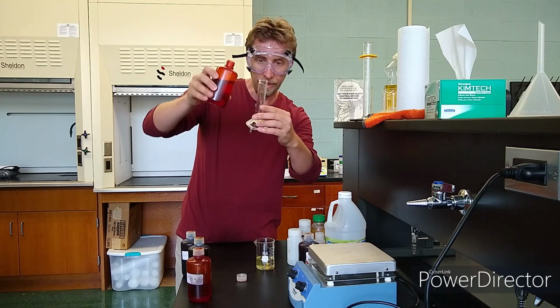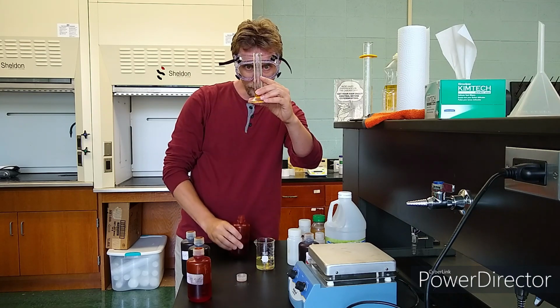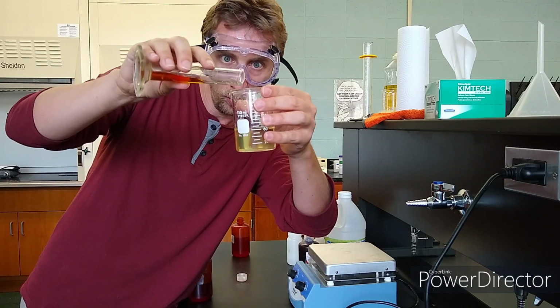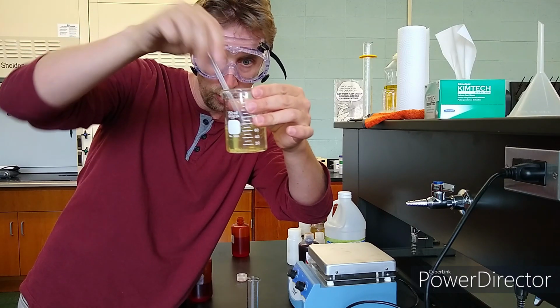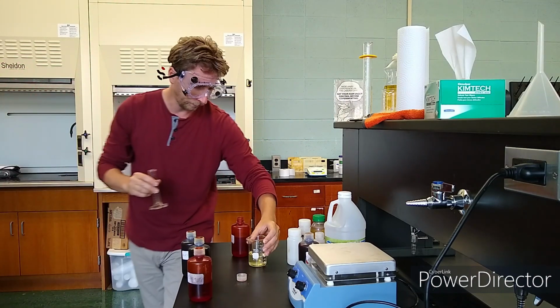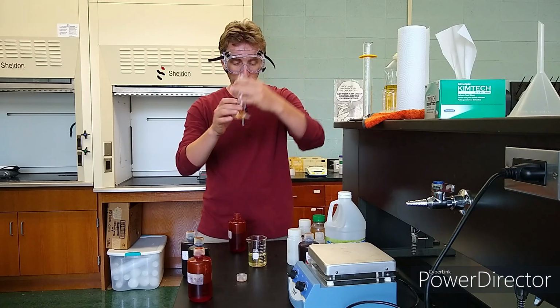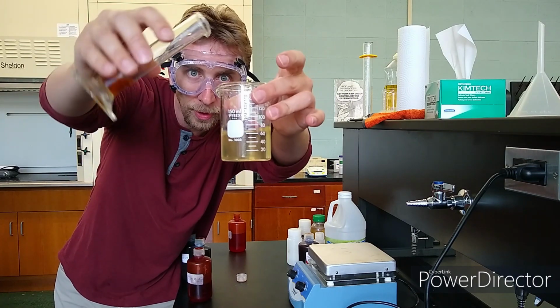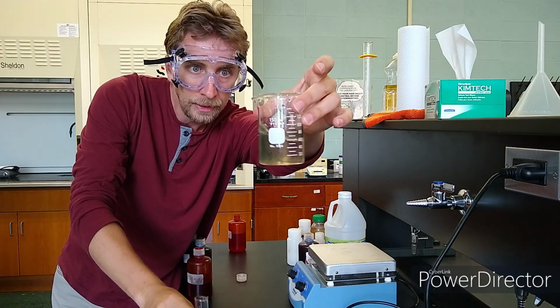5 more milliliters of iodine. Whoop, that's 6 more milliliters, 7 more milliliters. Let's try that again. Ready? Man, what happened to that color? It just disappeared. That's amazing. Let's try 5 more milliliters. I know this is just going to disappear because the first 5 milliliters disappeared almost instantly. So watch this. It's gone. It disappears like nothing.